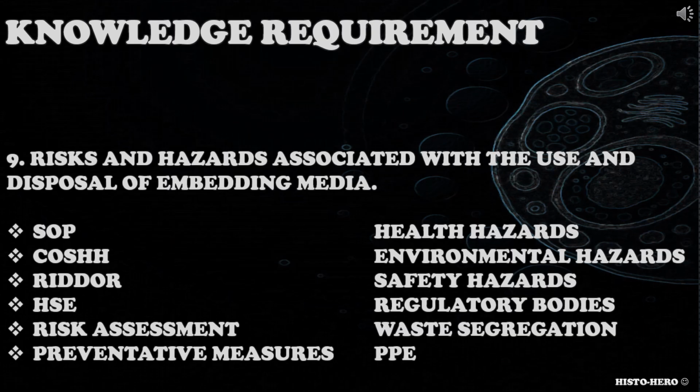When addressing this knowledge requirement, candidates should consider health hazards, safety hazards, environmental hazards associated with embedding media used, COSHH, SOPs, PPE, regulatory bodies, waste segregation, risk assessments for embedding media, RIDDOR, HSE, preventative measures, and so on.